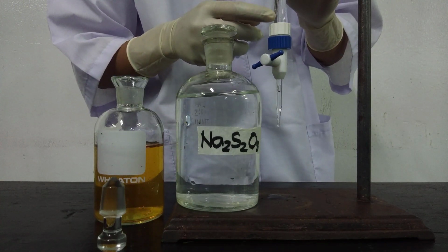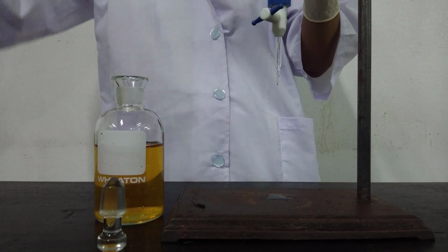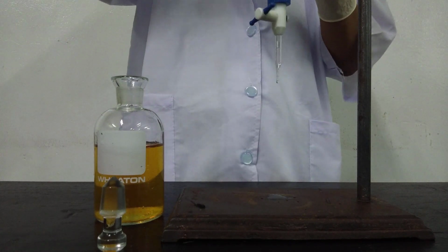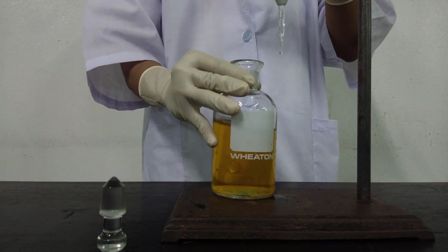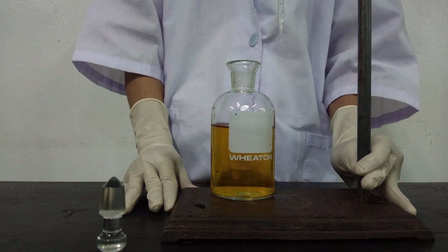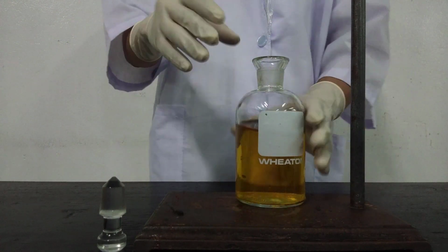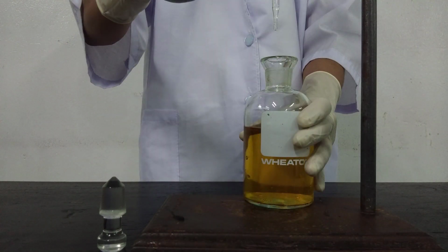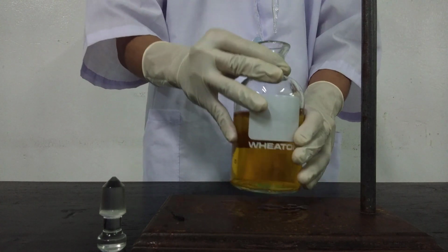Now after this process, we will start with our titration using sodium thiosulfate solution. We will continue with our titration until the solution starts to become of pale yellow color.